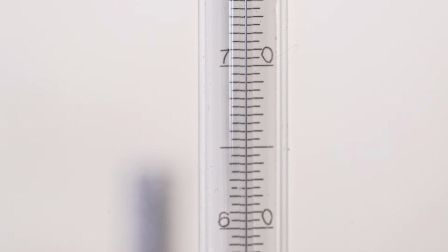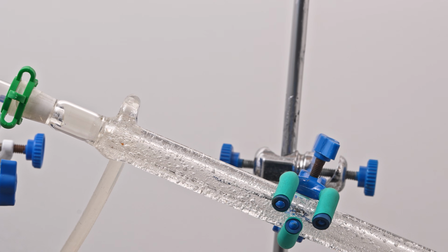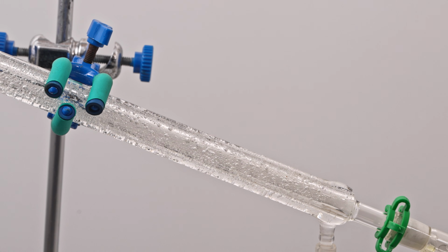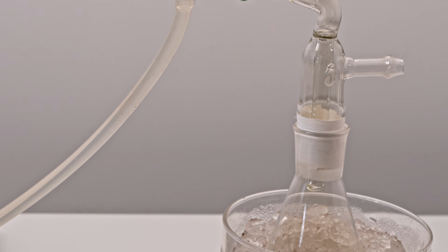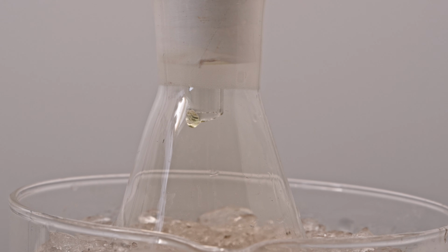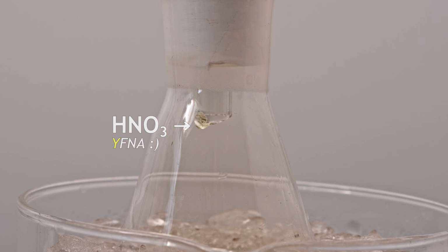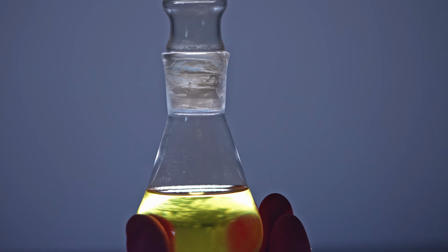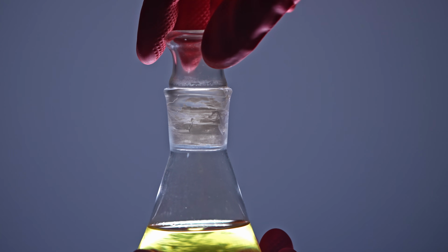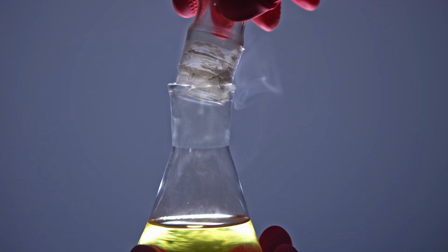Once the temperature reaches about 85 degrees Celsius, the nitric acid will start distilling over. The nitric acid produced this way is always yellow, since some of it decomposes into nitrogen dioxide that stays dissolved in the acid. You can clearly see the pale yellow drops of nitric acid here. Once the synthesis was finished, we got this flask of yellow fuming nitric acid. Just look at how much this acid fumes in the air.